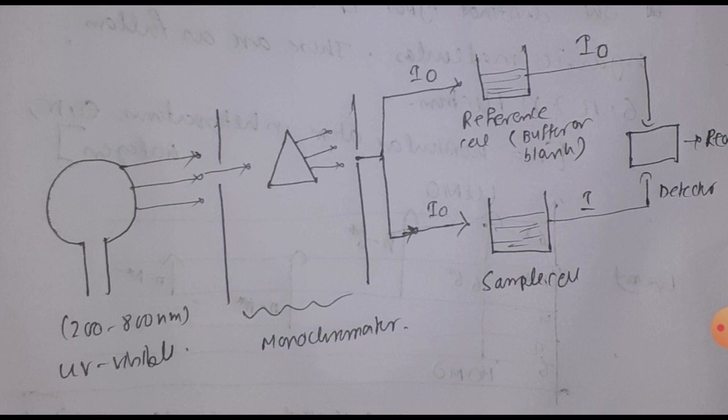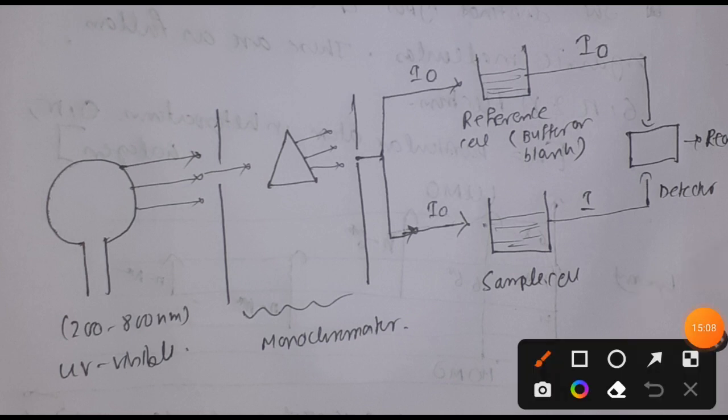How is it determined? Remember, it is completely determined by the energy of the electromagnetic radiation. It totally depends on the type of food we are eating, right? If we consume junk food, we are more excited than when eating a healthy diet, right? That is the case here also, because the energy of the electromagnetic radiation will determine what kind of transition is going to occur.